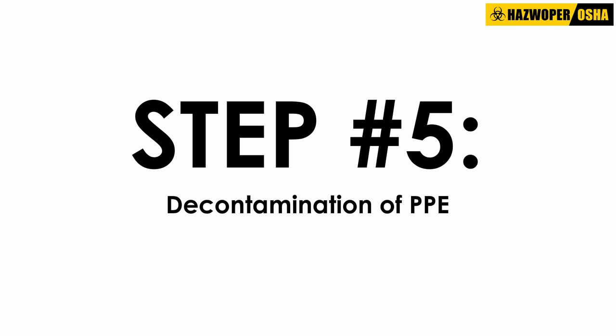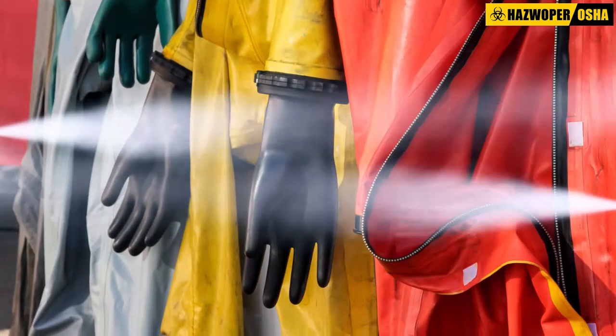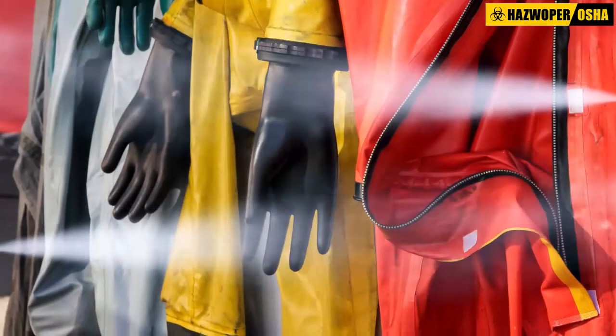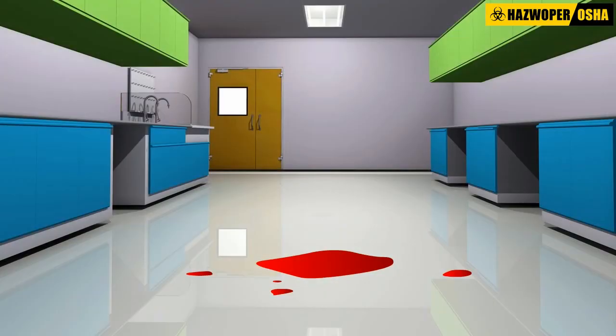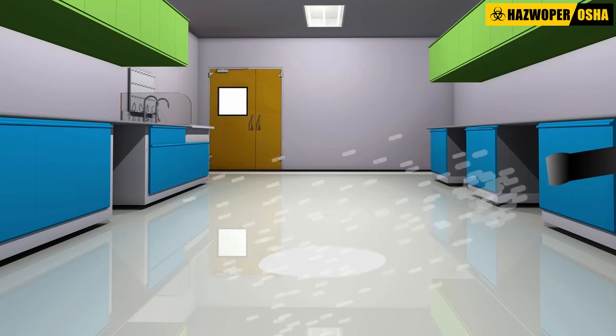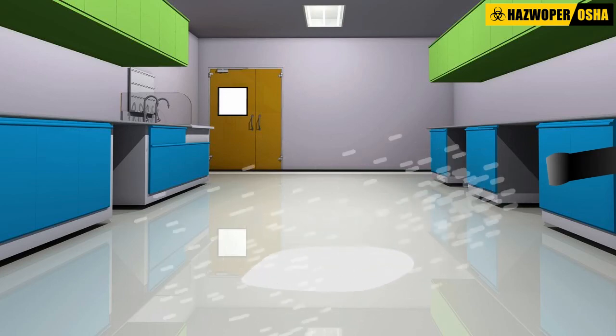Step 5: Decontamination of PPE. Decontaminate reusable PPE with an appropriate disinfectant. Step 6: Rinse the contaminated area. After the contaminated area has been cleaned, it should be rinsed with fresh water to remove any residue from surfaces.